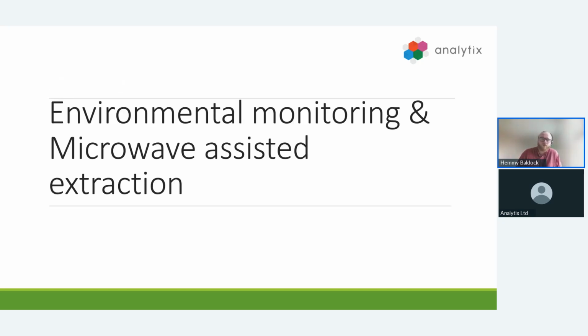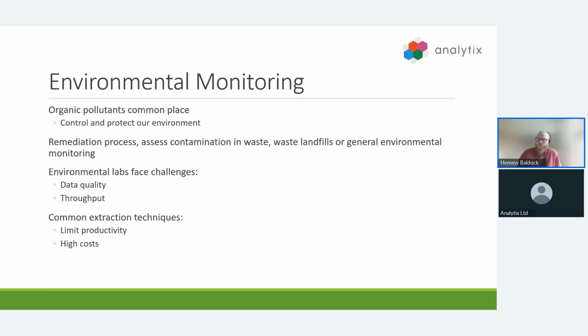So let's start by talking about environmental monitoring and microwave-assisted extraction as a technique. The environmental testing industry and research is one of the largest users of analytical instrumentation, carrying out important work leading to the monitoring and control of pollution, with the ultimate goal of protecting human and environmental health.